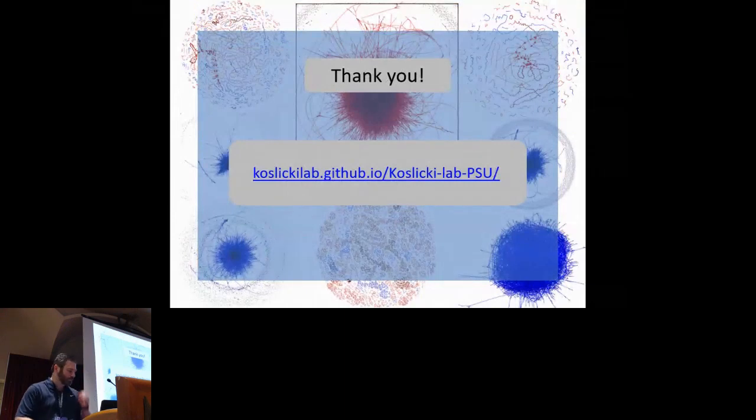Question for David? Amazing, Doug. I'll definitely be using the tool. Quick question, and it could be a naive one. Does it do taxonomic classification for contigs or for MAGs, or it doesn't matter?